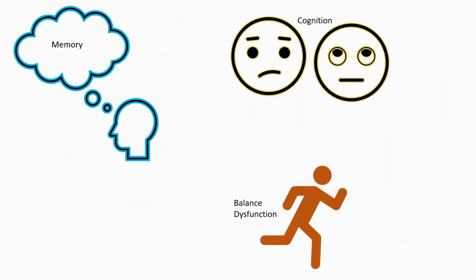So primarily, I have categorized them in three parts. First is memory. So we can do tests which relate to memory and only memory. For example, where is my food? Where do I go to find my food? And all these things. And the other is cognition. Cognition is a wide term which takes care of many things. But to put it simply, cognition talks about how to deal with people in general. I was talking about social tests, right? It comes in there. Second, if something new comes to you, how you are going to respond. So your response is also a part of cognition, right?